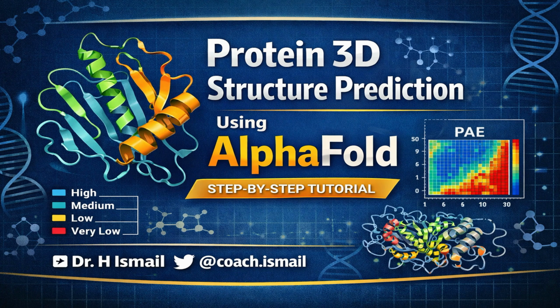In today's tutorial, we will learn how to predict protein structure using AlphaFold and how to analyze the effect of mutation on protein structure. Specifically in this tutorial, we will learn to predict the 3D structure of normal protein, introduce a mutation into a protein sequence, then predict the mutated structure, and then finally compare both structures. This type of analysis is widely used in structural biology, protein engineering, drug discovery, and disease mutation studies.